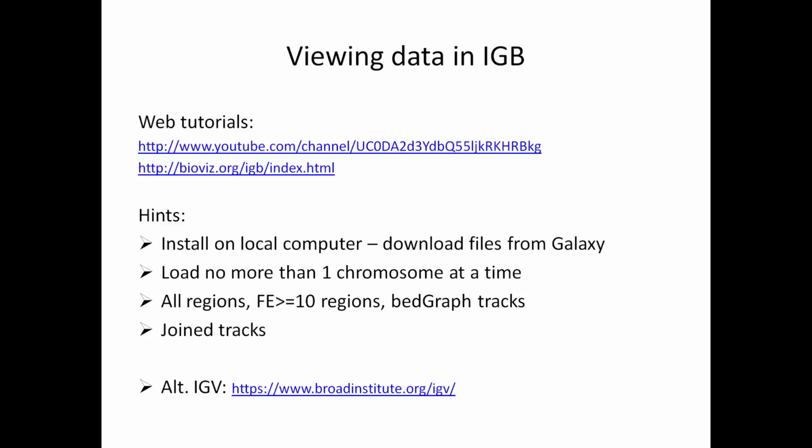For this tutorial I am recommending the Integrated Genome Browser as it allows you to view the bedGraph files locally on your own computer. The IGB website contains all you need to get started, and their YouTube video does an excellent job of describing its functionality in relation to a ChIP-seq project. Another alternative is the Integrative Genomics Viewer, IGV.